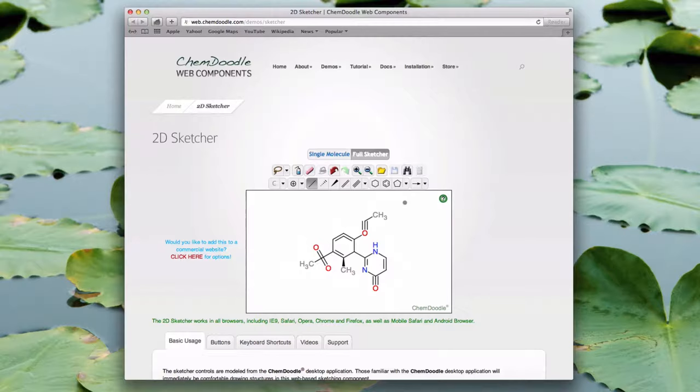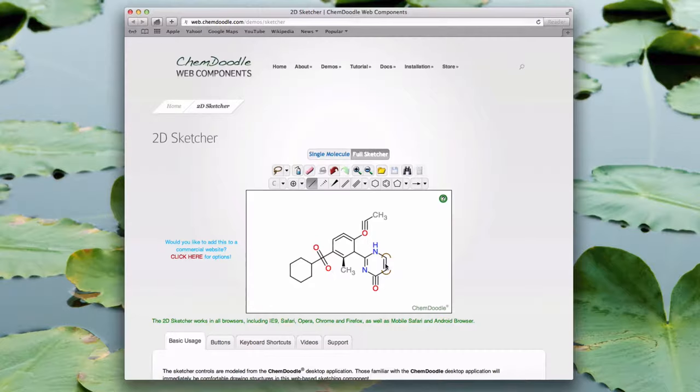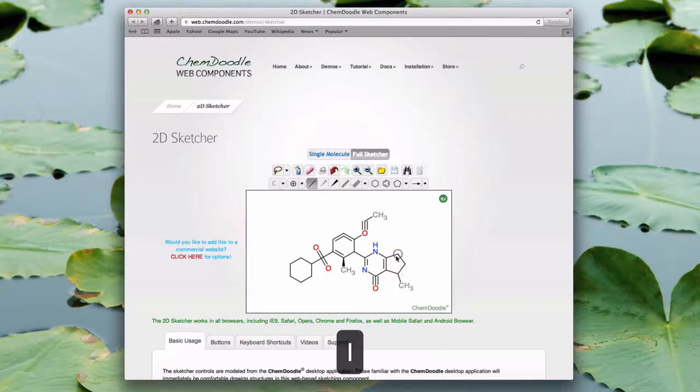If I was on a tablet or mobile device I could use a pinch gesture for zooming instead. As you can see the structure is almost complete but I have some fine tuning to do before it's ready. First, I can add rings by pressing Shift and then a number. In this case pressing Shift and 6 will give me a cyclohexane ring. I can also do this while hovering bonds — hovering the desired bond and pressing Shift+5 creates a cyclopentane ring.